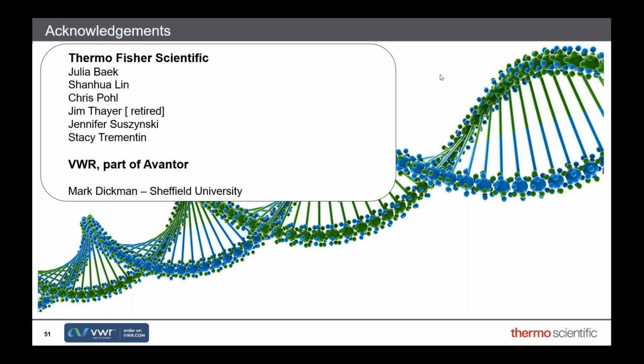Next question is, what is your recommendation for separation of oligonucleotides from tissue homogenate? Which column can be used? I'd go ion exchange, because, and again, it's what molecule you're actually looking at. If you've got something that's big, that's going to stick on the ion exchange column like glue. If you've got a short interfering RNA that's fully thiolated, that's going to stick on like glue as well. Everything else is going to come out in front.